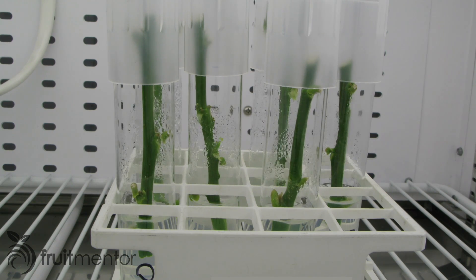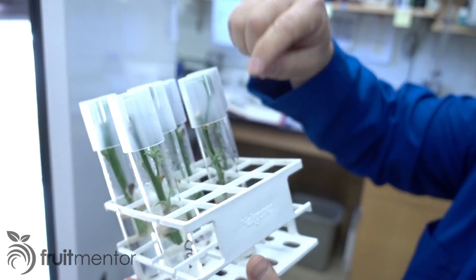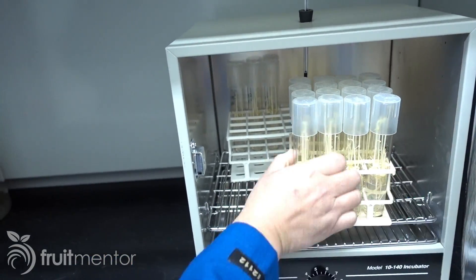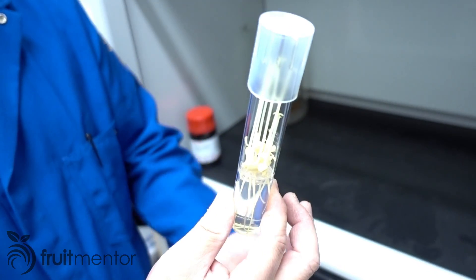Within a few days, buds on the cuttings start to grow. Once there is sufficient growth, the cuttings are removed from the incubator to be grafted. These rootstock seedlings, which were planted in test tubes with the plant growth medium and grown inside of a dark incubator, are the right size to be grafted.